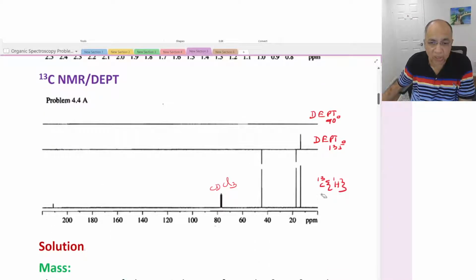The bottom one is a proton-decoupled carbon 13 NMR. This triplet peak at 77 is due to the solvent CDCl3. Just ignore this peak. It is a very characteristic peak for solvent CDCl3. And then you find there are only 4 carbon peaks, so only 4 types of non-equivalent carbon. And this downfield peak at about 212 is undoubtedly a carbonyl carbon, aldehyde or ketone.